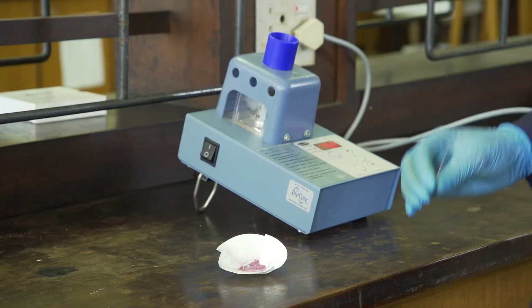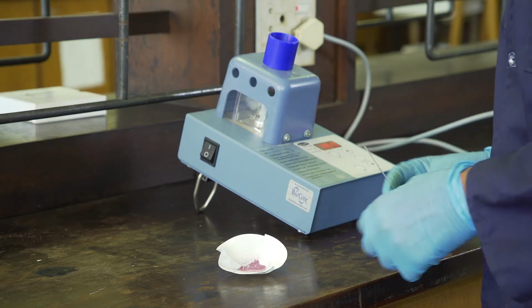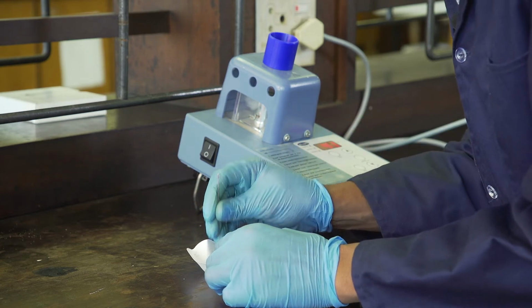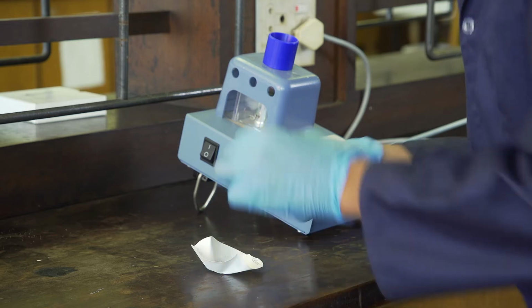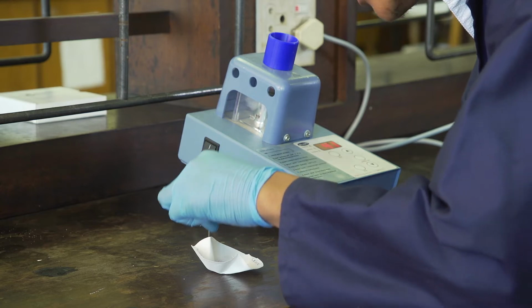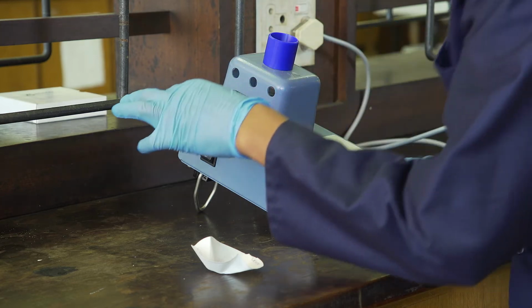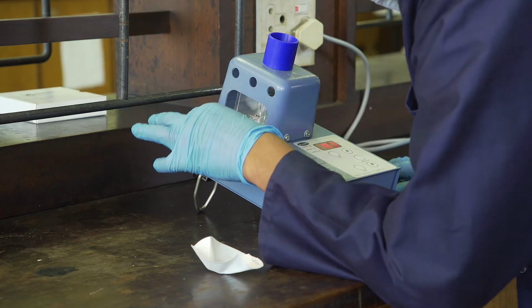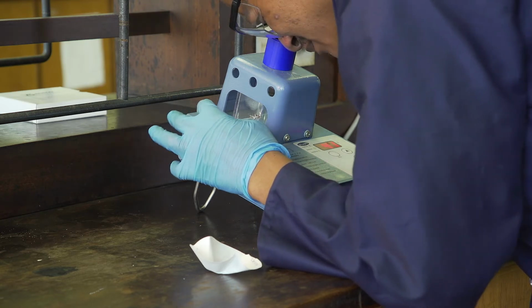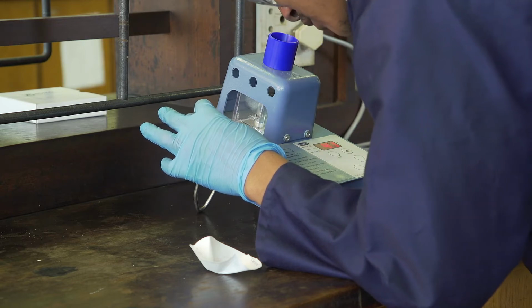To obtain the melting point of our chromium acetylacetone complex, we use a capillary tube inverted into the crystalline powder, then gently knock the powder down to the bottom of the closed end of the capillary tube. This will be followed by inserting the capillary tube into the optical path length of the melting point apparatus and begin heating to observe the melting point of our solid crystals.